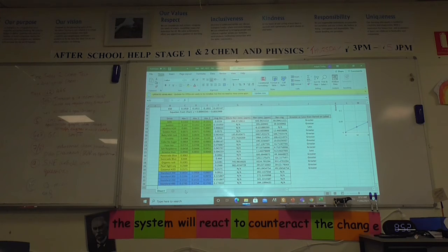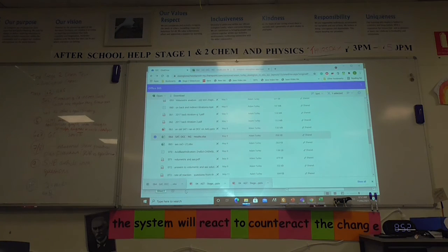You can see here that for many of the stated concentrations, the amount of sodium that was present was actually greater. They had an hour to process these results. I just gave them the raw results. Now, do we have an example of the raw results? Yes, one here. What comes out of the machine itself is fairly simplistic, and you have to process this stuff quite manually.